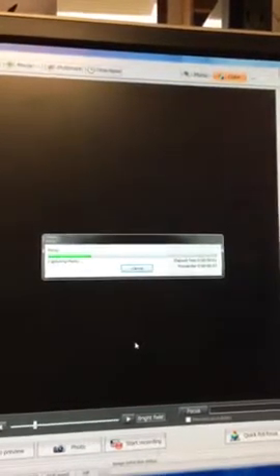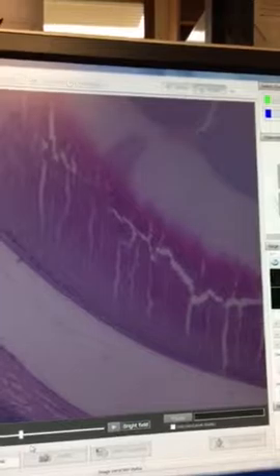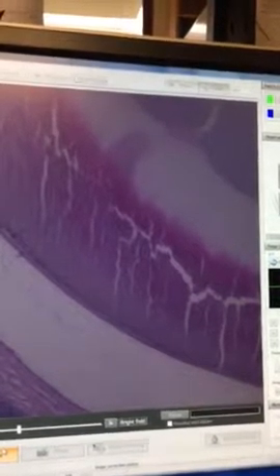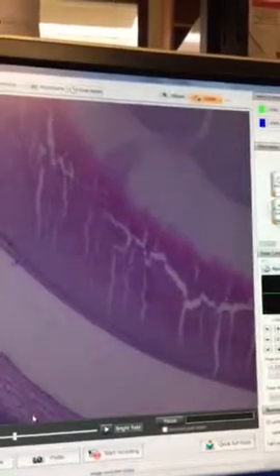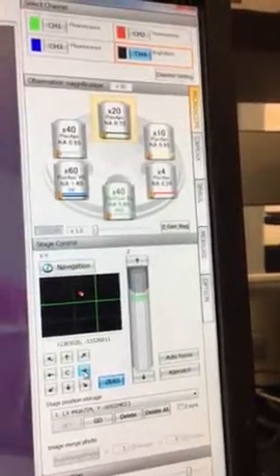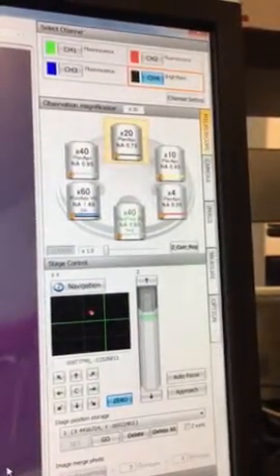Now you're going to toggle between photo and preview. So you take your photo. That actually does collect an image, which you can come back to later. Now go back to preview. You see this little thing right here? This thing? Click that. It moves you over one notch.